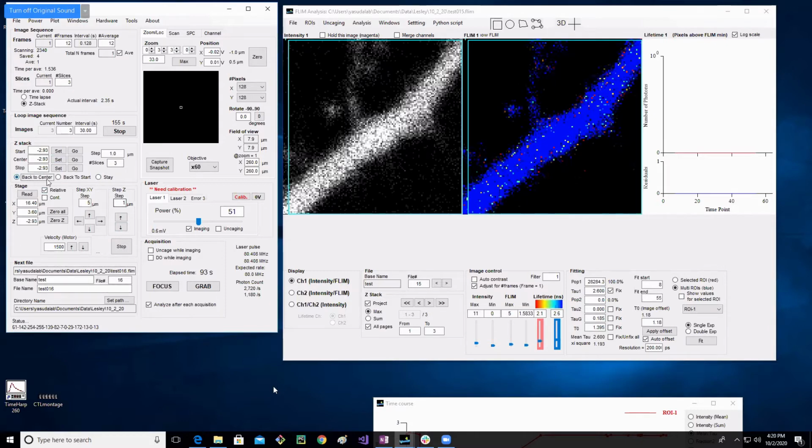Okay, just so you guys know, this down here is another way of reading out your motor position. One thing that really comes in handy is to see how deep you are if you're trying to determine if a spine might be too deep to uncage. You guys might have heard that we tend to uncage on spines, I say 50 microns or above. Some people say 30 microns or above, because it's hard for the uncaging laser to penetrate really deep into the slice with full efficiency. But you're like, well, how can I possibly tell how deep I am in the slice?